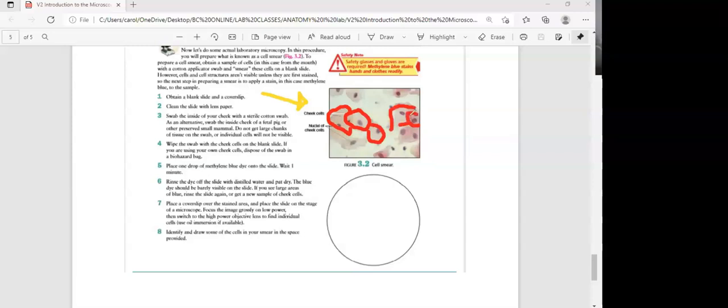Because remember, these are cuts of tissues, right? Of groups of cells that you have in your body, right? In the person's body. And as you know, they are not completely flat, right? They are at different levels. As you know, your heart, your liver, those are three-dimensional structures, right? So you can imagine that you have in there cells and structures at different levels, right?